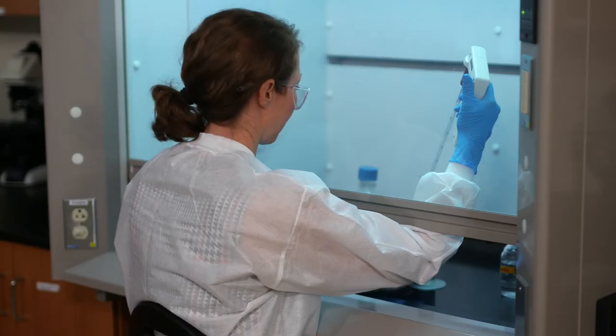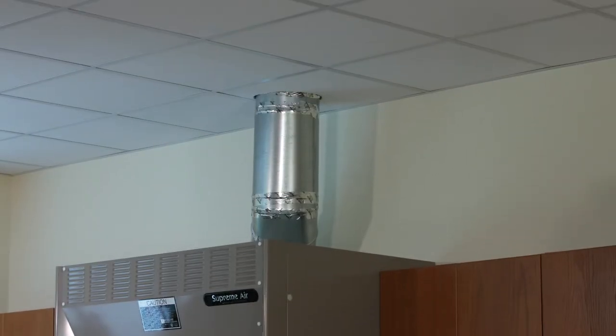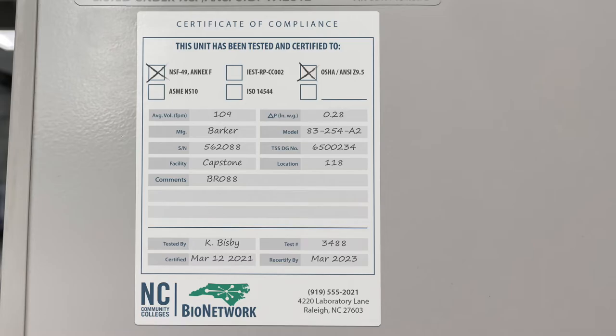A fume hood is used to protect you when working with toxic chemicals. The airflow moves the vapors away from you, through a duct, and safely outside of the facility. This tag lets us know that the cabinet has been inspected and certified.